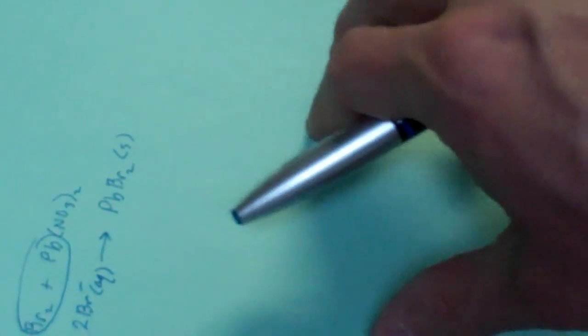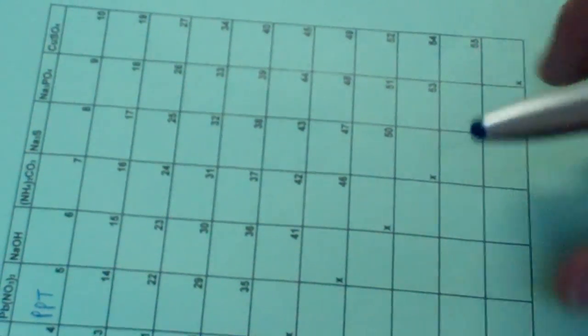Alrighty. Well, this will be a fun lab. It's going to take a little while to complete our data table here. And then, it will probably take you quite a while to complete the back side, because we are going to have a total, if you look at this, of 55 different combinations. So, that should keep you quite busy throughout the period, and then, of course, at home to finish it up. Alrighty. Enjoy.